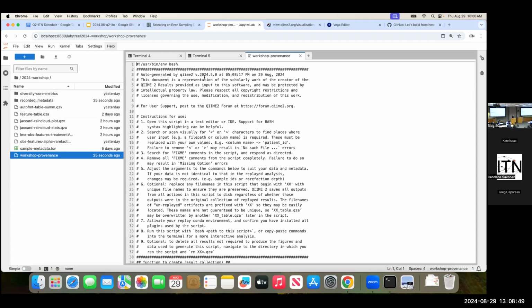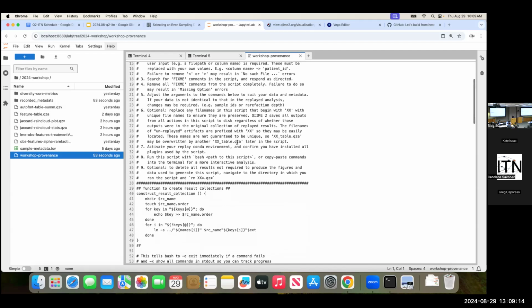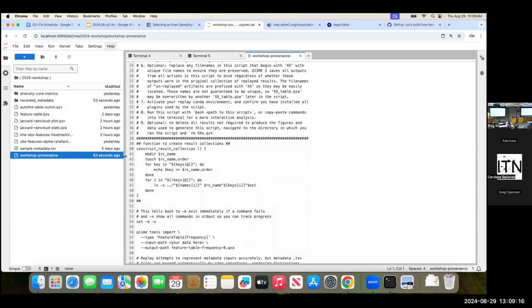Okay, so this gives us some information, and this will be the same with every single provenance unless provenance replay has been updated. They should be pretty similar. This just gives you a little bit of information, and you can feel free to read this on your own. Some of this might not be relevant to you, but some of it might be helpful. And then here is another thing that will stay the same, which is a function to create results collections.